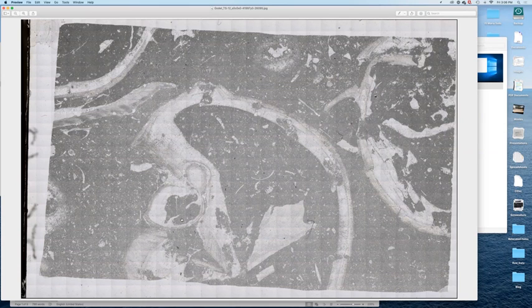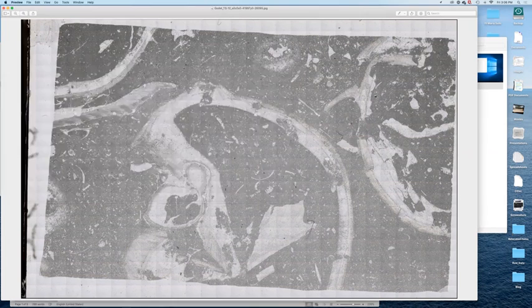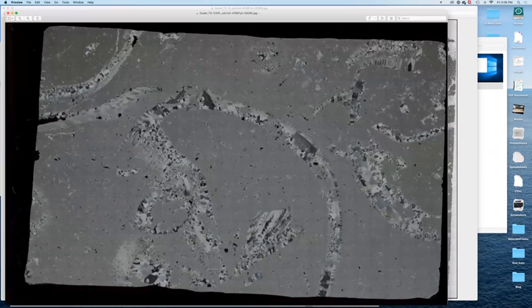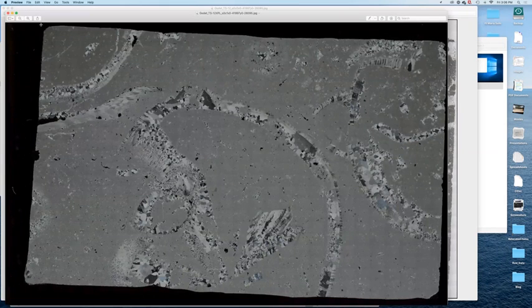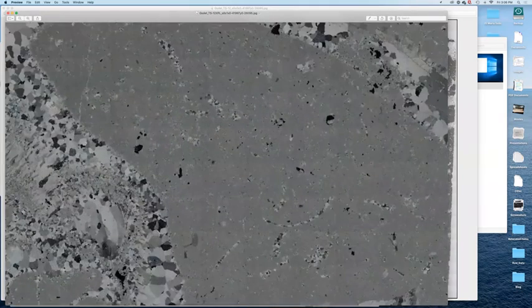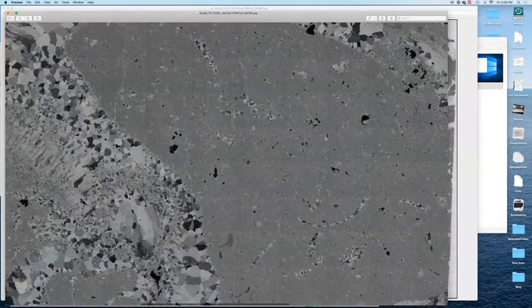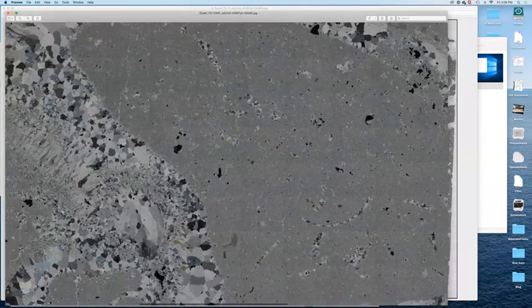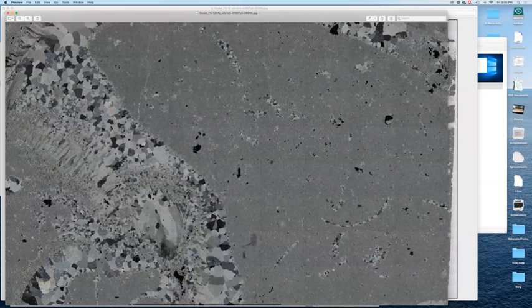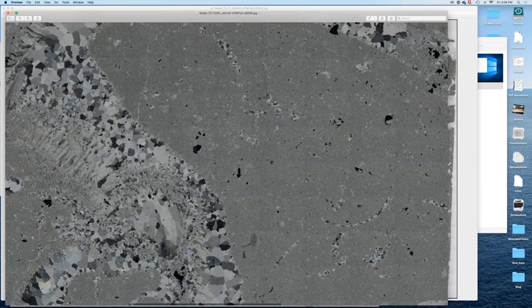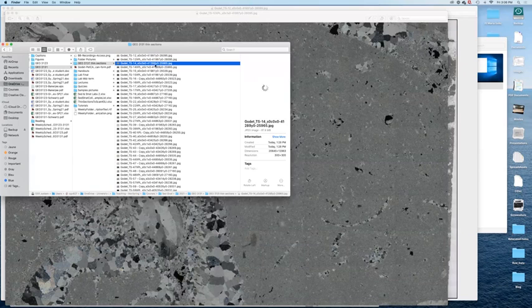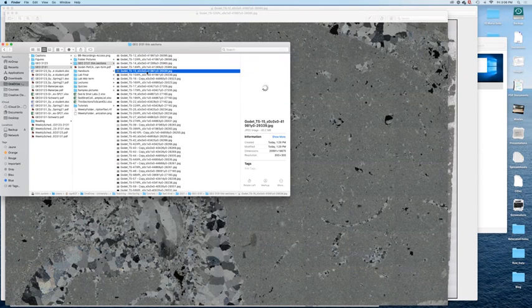So this is actually the same sample as before. So this is TS 12. I believe we can have a look at the XPL view of the same thin section. So this is not rotating anymore. But we can have a pretty good idea of what kind of mineral is making this mosaic here. This is calcite.